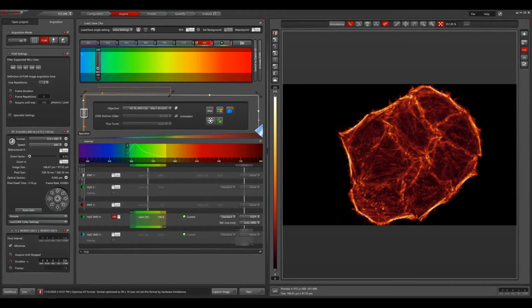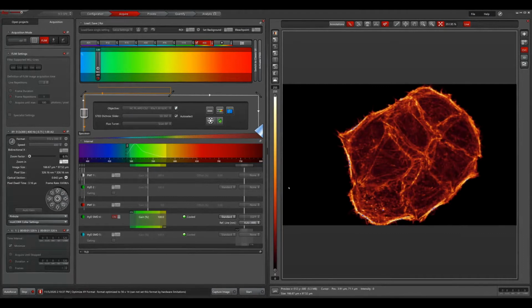Now let's have a look at what we can achieve here with Tau STED, which, as we have learned so far, allows us to significantly reduce both the excitation, but most importantly also the depletion laser power. And that should be much more gentle and beneficial to our living cells expressing GFP here. So what we're looking at right now is a confocal live image of the actin GFP. I'm exciting at 488, the optimal wavelength for GFP, thanks to our white light laser, and I'm detecting in the emission range thanks to our spectral sliders here.